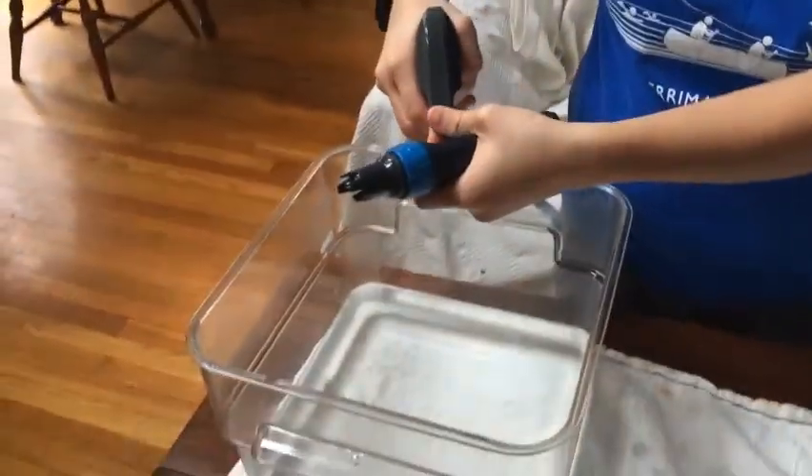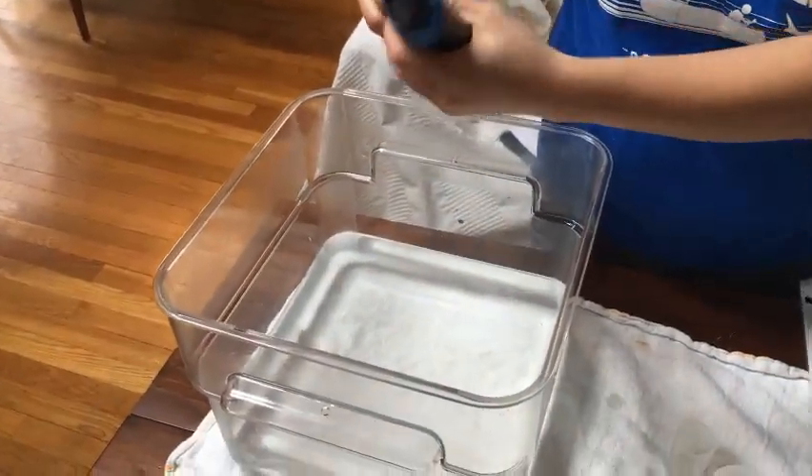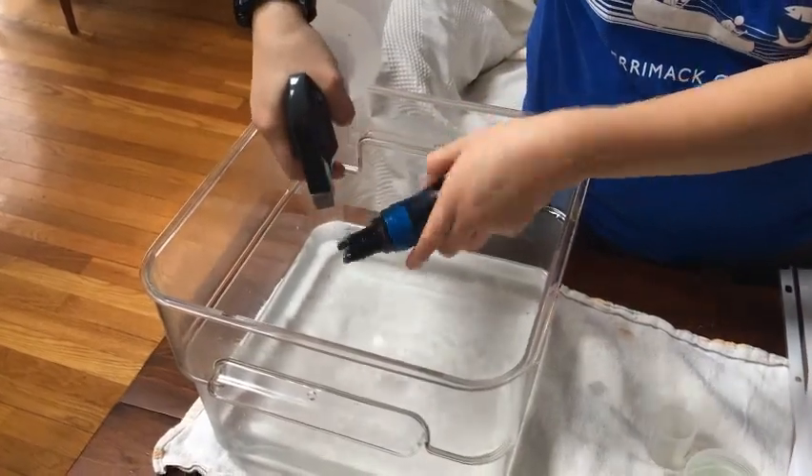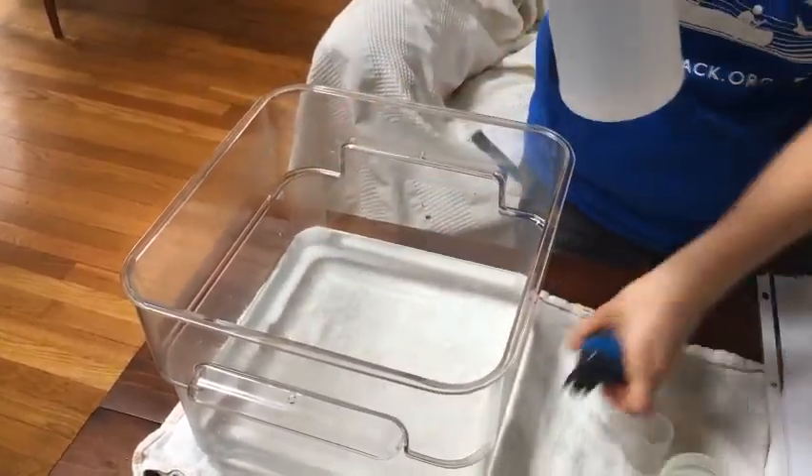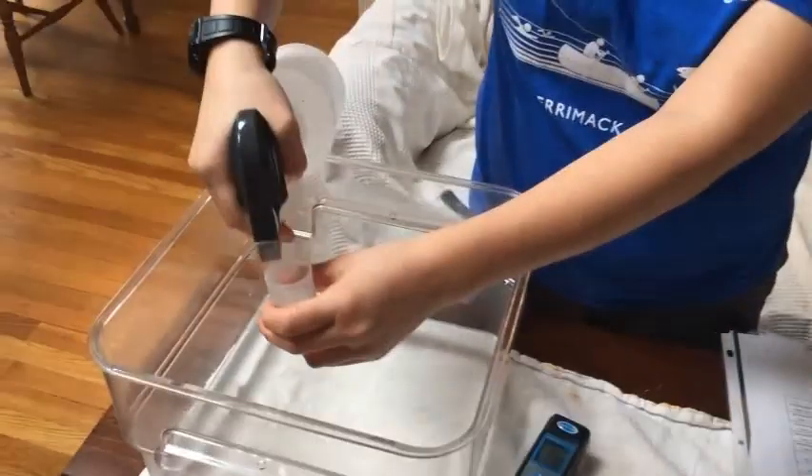Remember, everything that goes in the cap has to be sprayed down — before and after. So you spray the monitor down and then you spray the cap down.